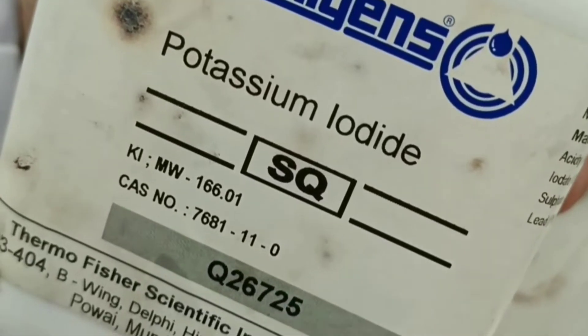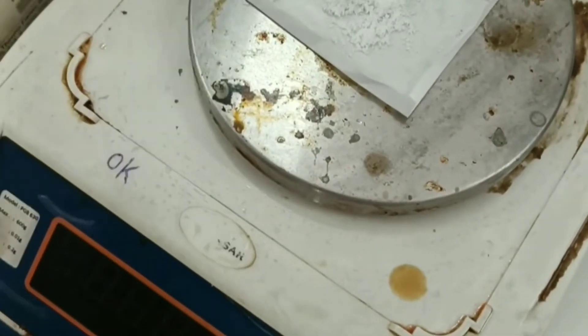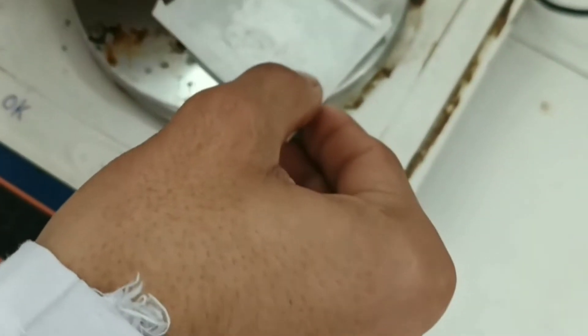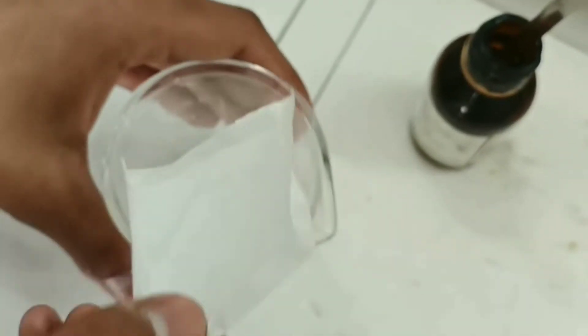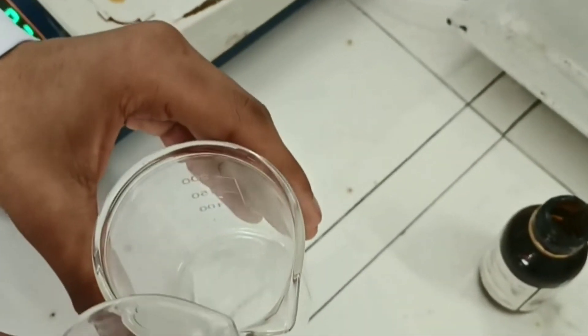First, we will weigh 1.5 grams of potassium iodide and dissolve it in a small amount of distilled water. Now mix it with a glass rod to dissolve it properly.